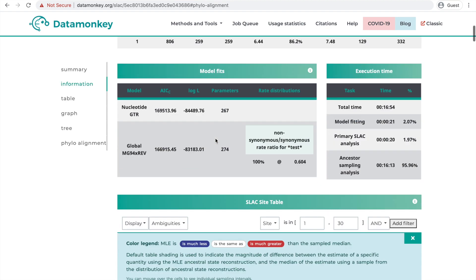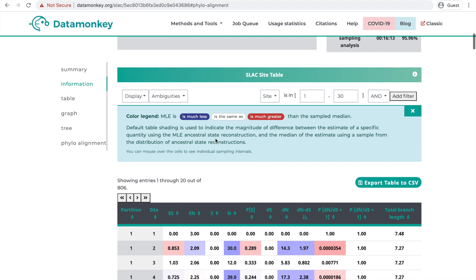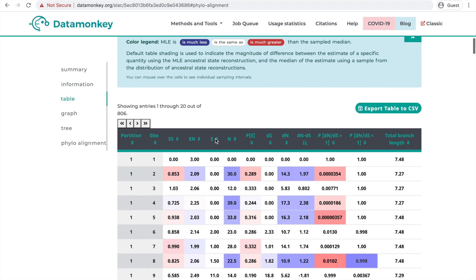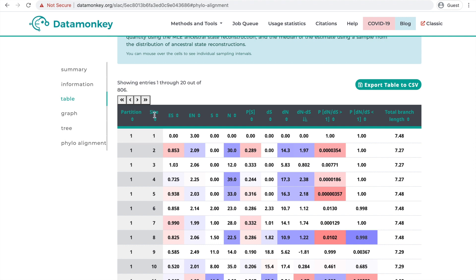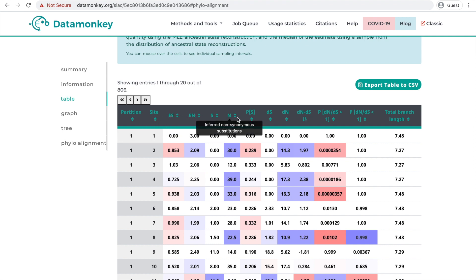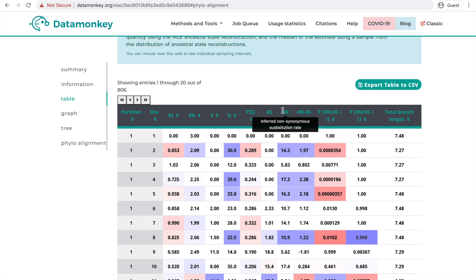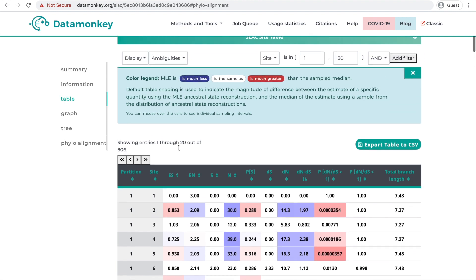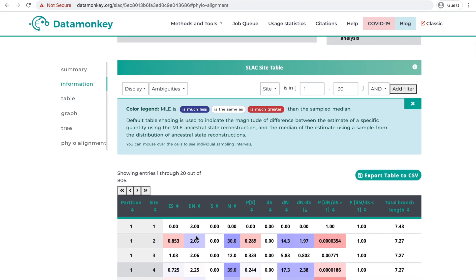Scrolling down to the SLAC site table, the site table will show each site and all sorts of parameter information that has been estimated at that specific site by SLAC, such as the inferred synonymous substitution rate, the inferred non-synonymous substitution rate, and the tree branch length. You can also filter this table based on all of these parameters.